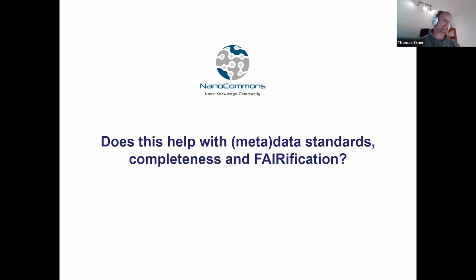On the one side, we have this central place. There is at the moment only one instance of these instance maps, therefore everything which exists is on there, and you can share it there publicly. I would not say that this is at the moment a FAIR data resource. Definitely not. But it might go there. But verification, I see more in relation to the data we actually create.